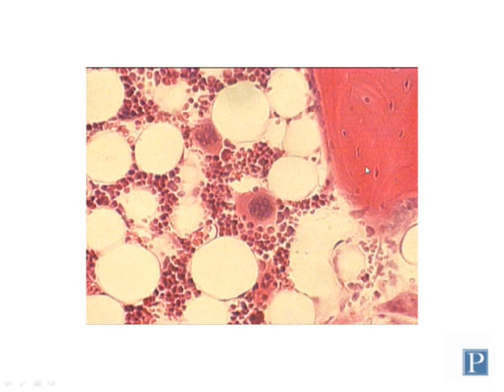You can see how small these osteocytes within the lacunae look here for comparison. And we look at these cells because they produce platelets, which are important for clotting of blood. So platelets are formed by budding off of the surface of these megakaryocytes.